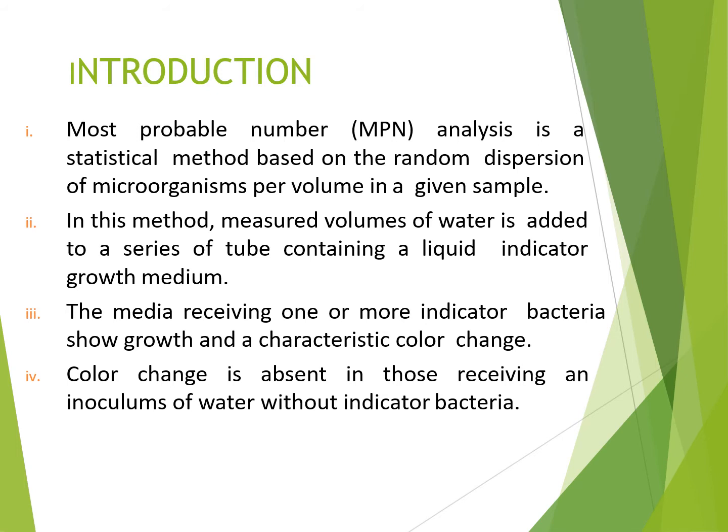In this method, a measured volume of water is added to a series of test tubes containing a liquid indicator growth medium. The media receiving one or more indicator bacteria show growth and a characteristic color change. The color change is absent in those receiving an inoculum of water without indicator bacteria.